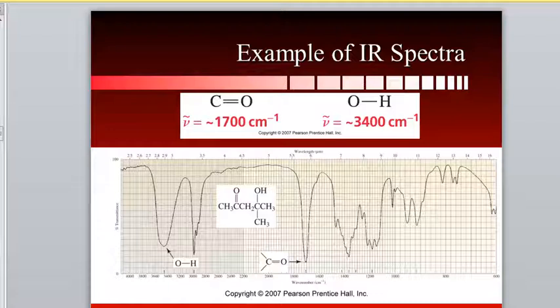Well, if the molecule has an OH group, an alcohol, this will happen around 3400 wave numbers. So at 3400, right here on the x-axis, I come up and I see a huge dip, right? The molecule is absorbing light because it likes that workout day. And then it goes back up. That is symbolic of an OH group, an alcohol group.